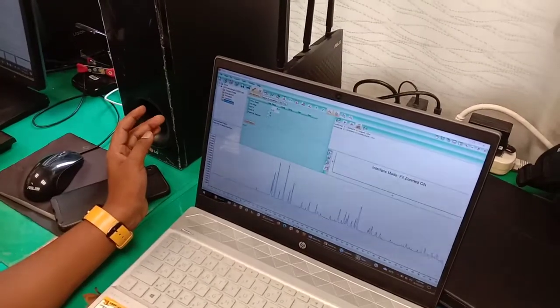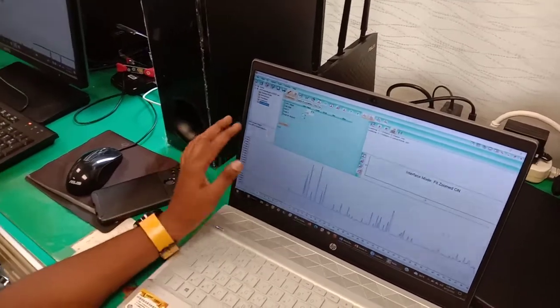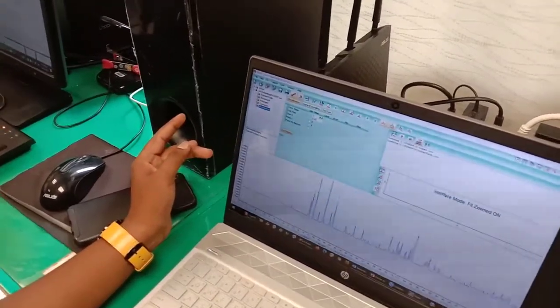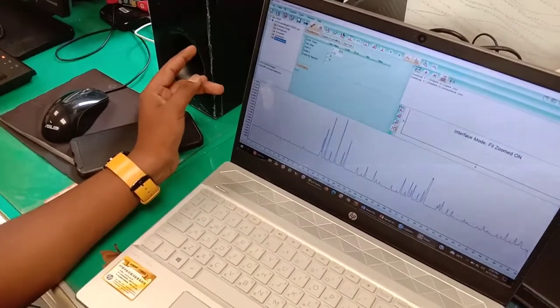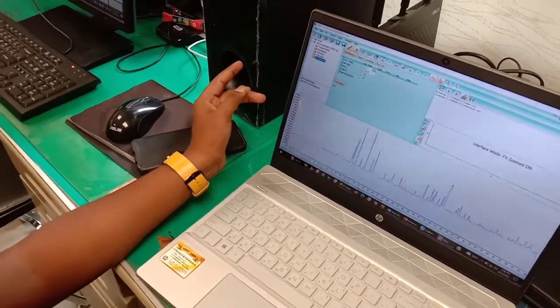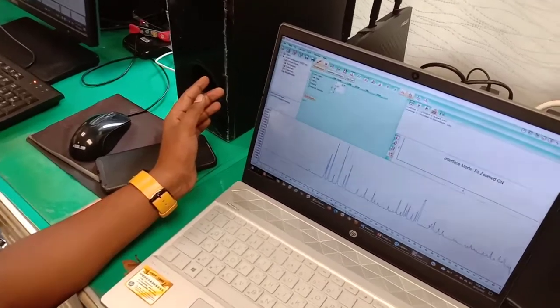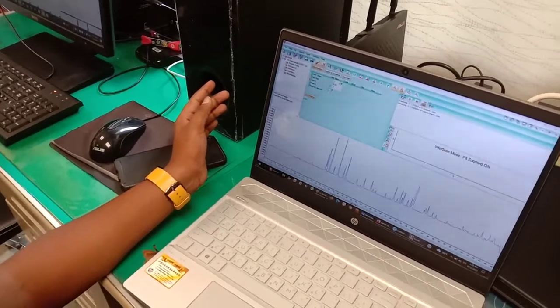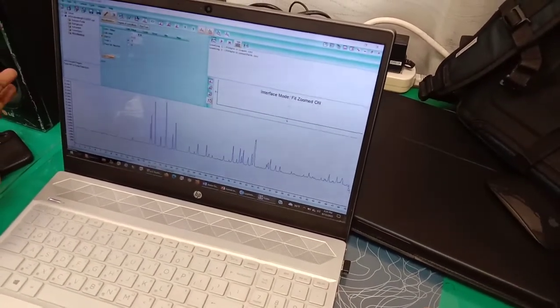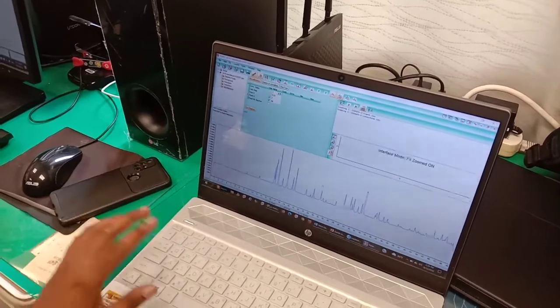Okay. So the excluded region is something we can use when we have some problem in our XRD. Here you can see the first XRD peak is actually at somewhat after 8, right? But you can also see some kind of steep rise, and this kind of thing spoils the fitting. So you can choose X to be 7. At the same time you can see the end tail, it is falling down. Even in this case the fitting will be a little bit complex, so you have to choose 48, the minimum one. So just 48. Okay, this is the one.